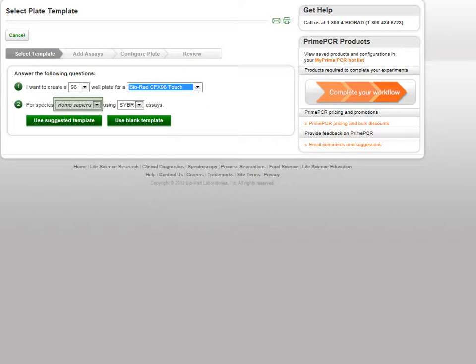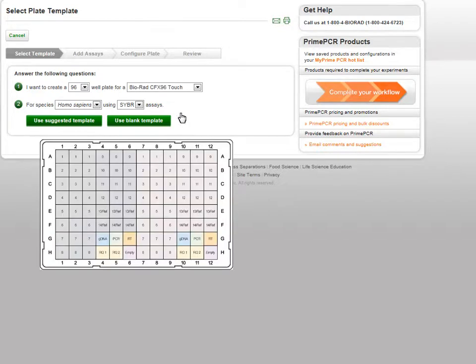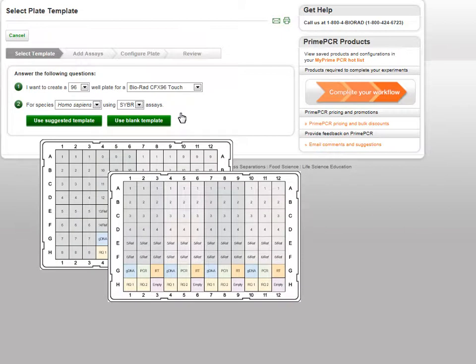Next, select the species and type of assays you would like on your plate. At this stage, you can choose to use a suggested plate template or a blank template. Suggested plate templates are illustrated guides that aid in laying out your plate based on the number of unique assays, replicate assays, and control assays you would like on the plate.